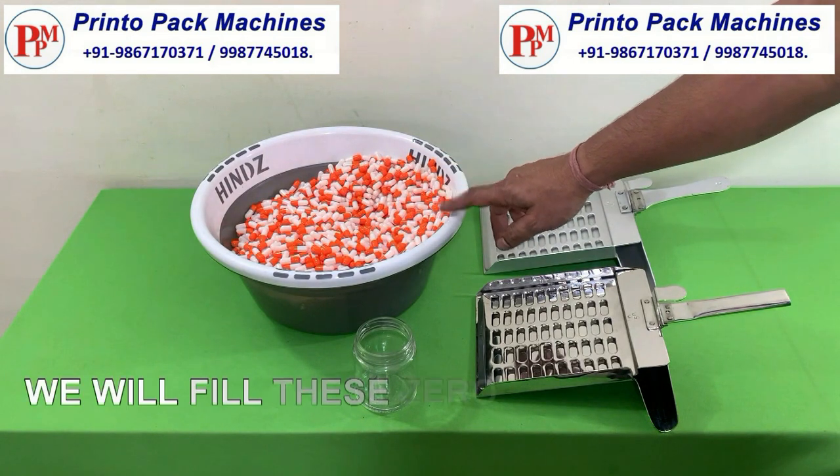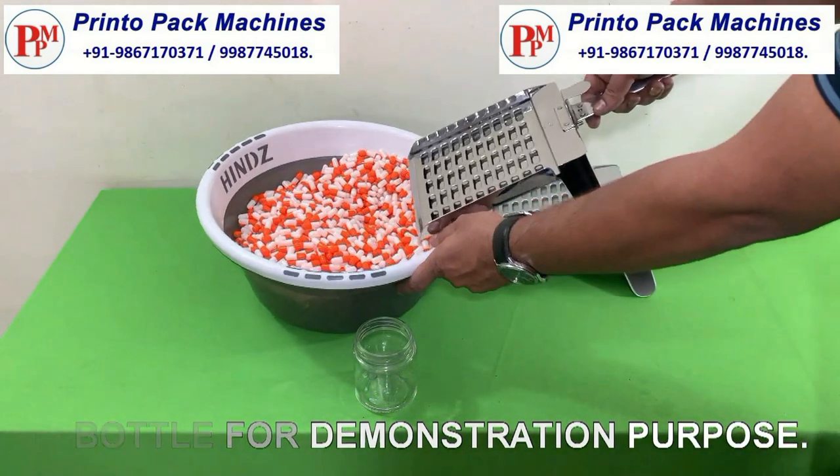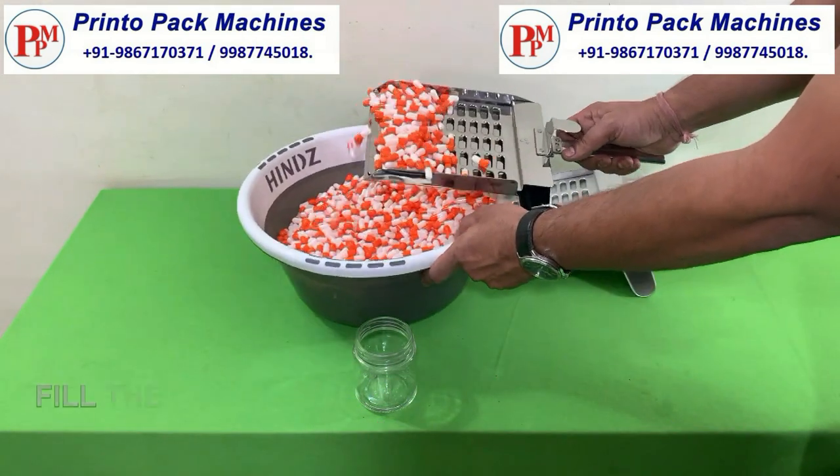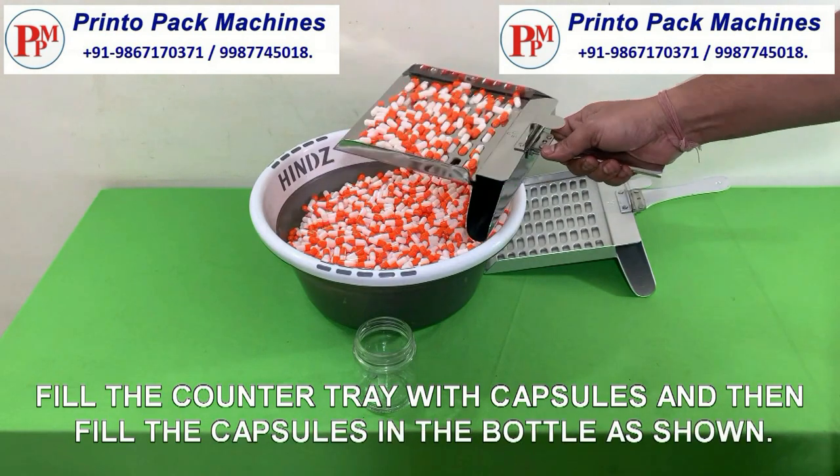We will fill these zero size capsules in a bottle for demonstration purpose. Fill the counter tray with capsules and then fill the capsules in the bottle as shown.